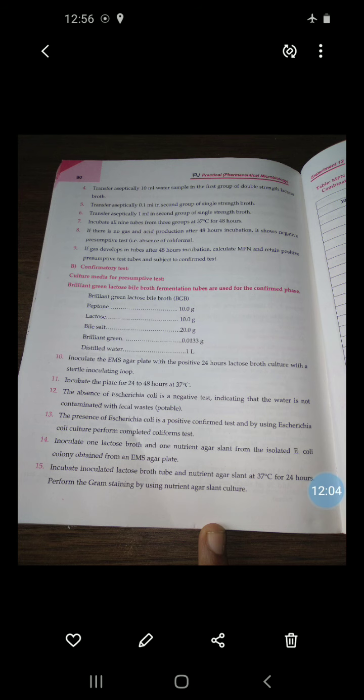First, inoculate an EMB agar plate with a positive 24 hours lactose broth culture with a sterile inoculating loop. Then incubate the plate for 24 to 48 hours at 37 degrees Celsius. Then absence of E. coli is a negative test, indicating what? That is the water is not contaminated with fecal waste. Then if the presence of E. coli is positive, confirm test, and by use of E. coli culture perform a completed coliform test.